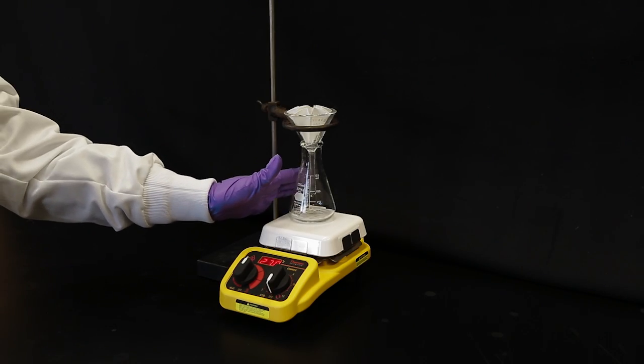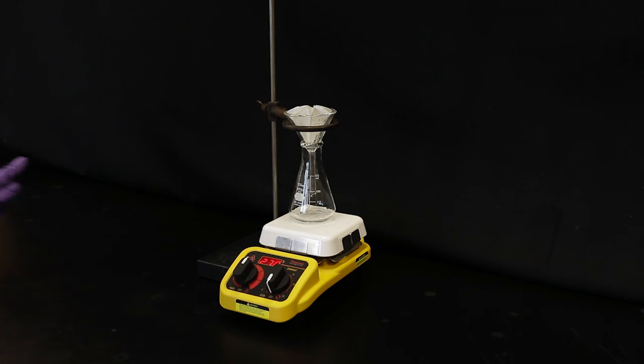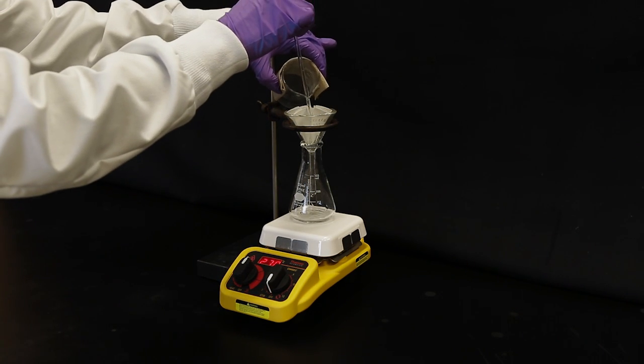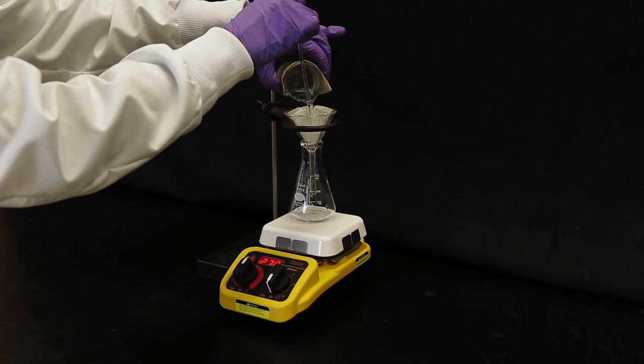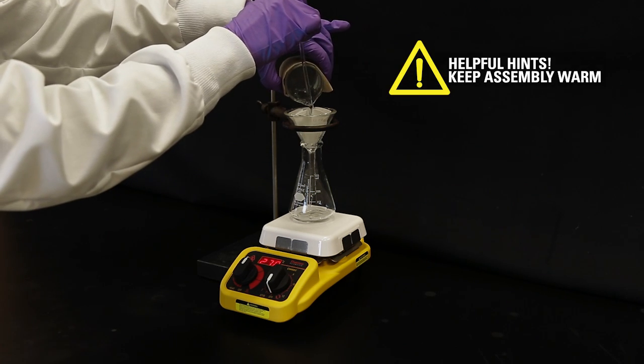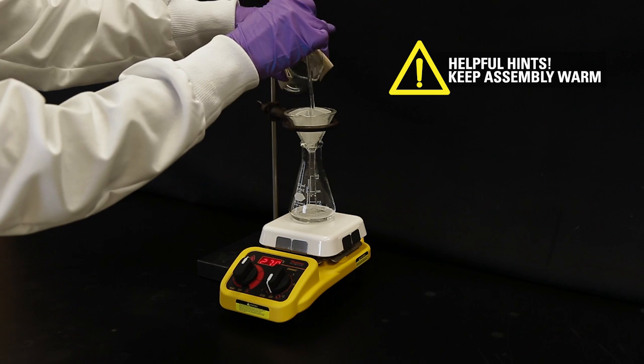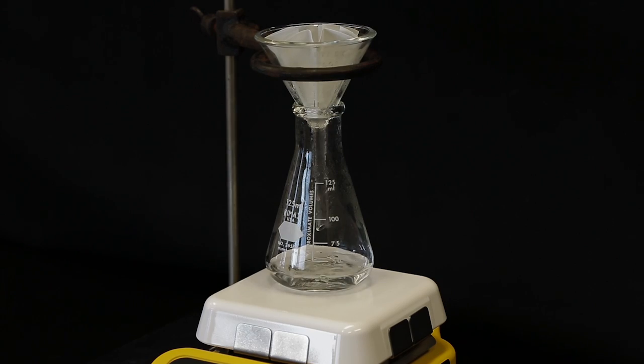When the assembly is warm to the touch, pour the beaker of solution over the pleated filter paper and let it drip into the warm Erlenmeyer flask. By keeping the assembly warm, you will avoid the loss of any material due to early crystallization.